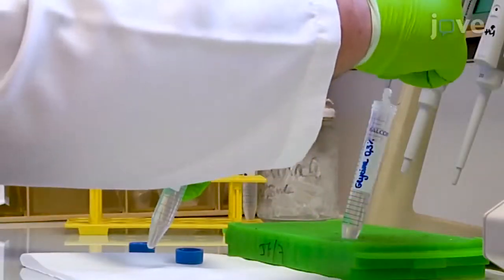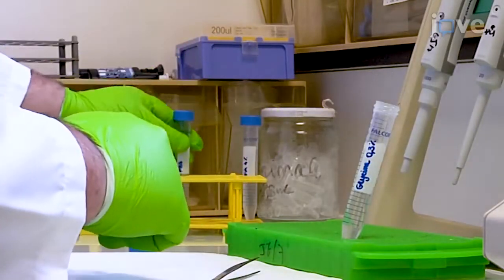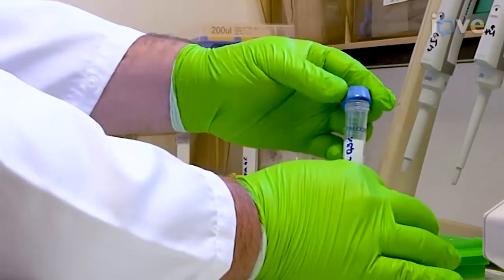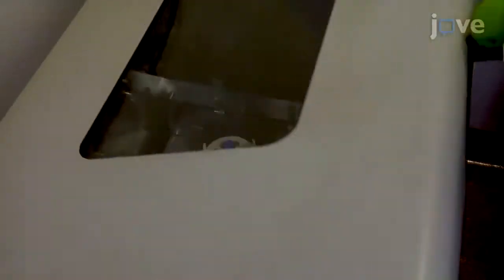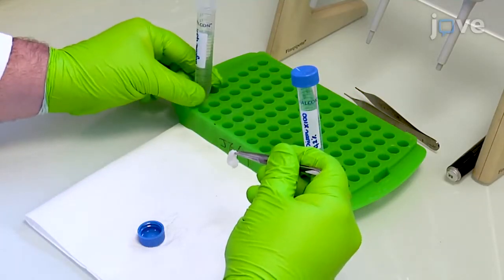Transfer the tissue to a 15 mL tube containing 10 mL of 0.3% glycine in PBS for a 2-hour incubation with shaking at 37 degrees Celsius to quench remaining free aldehyde groups.